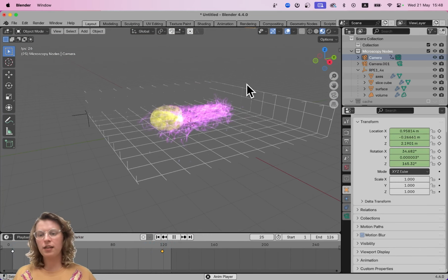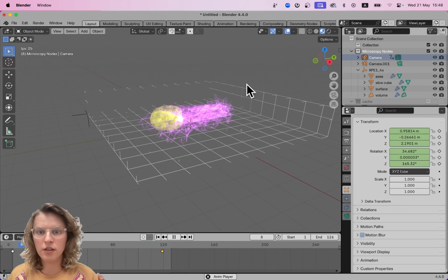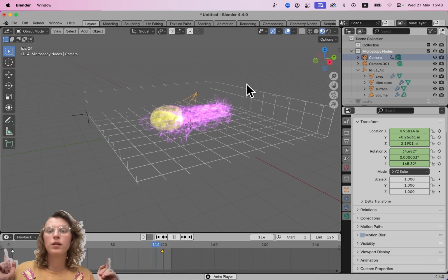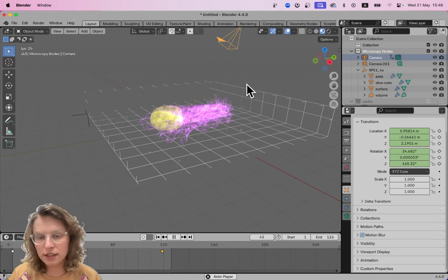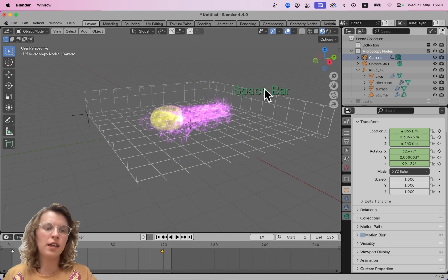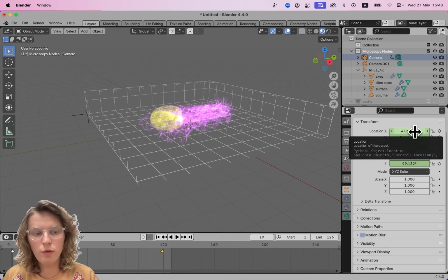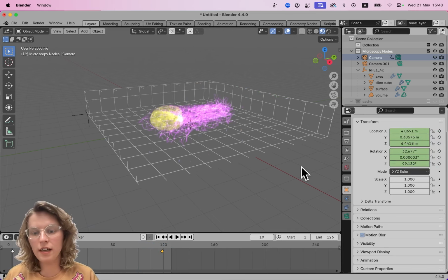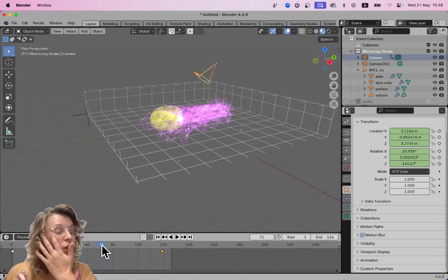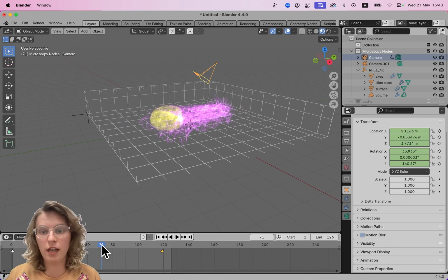The fun of Blender is that almost all the values in Blender are animatable. So we can also animate the thresholds of your surface masks, or the intensities of your pixels, or anything that is a value where you can hover over it and press I, you can make a keyframe out of, and you can start animating it, which gives a lot of power to just animate whatever you want in Blender.